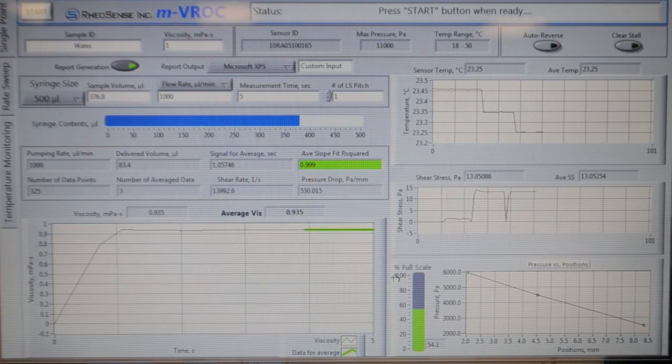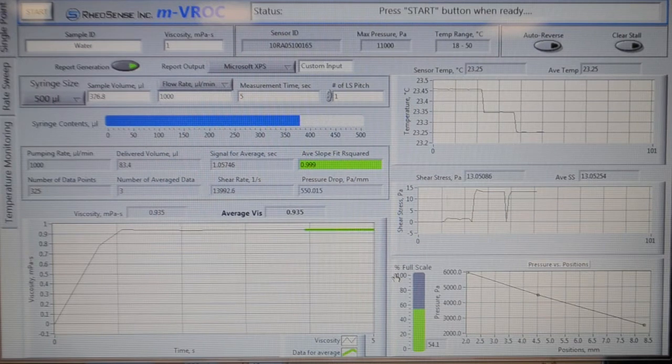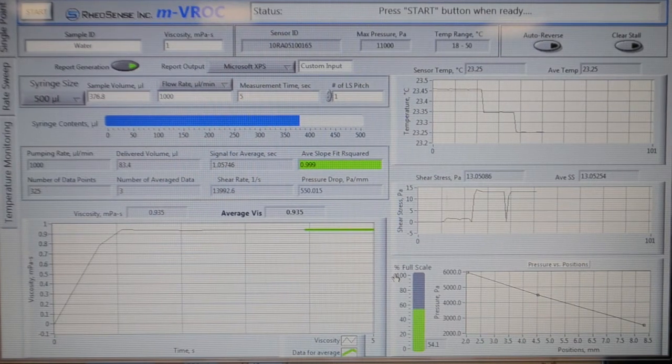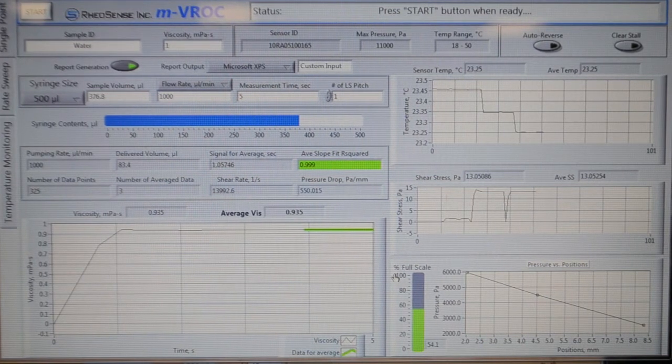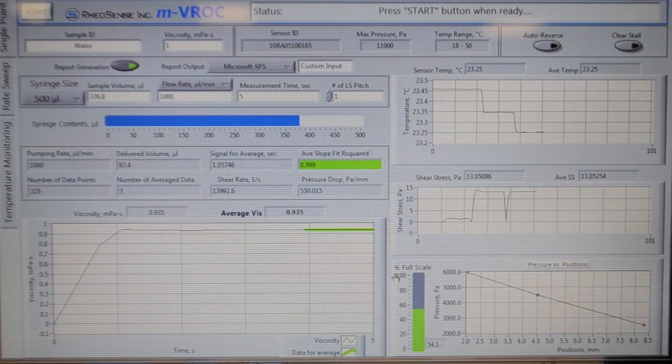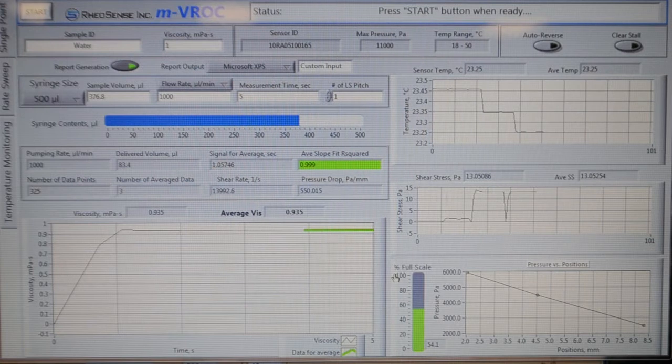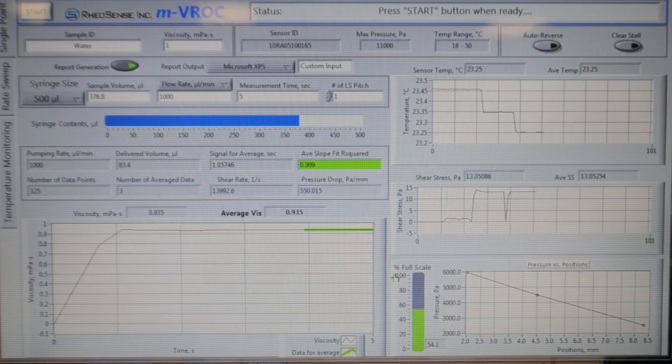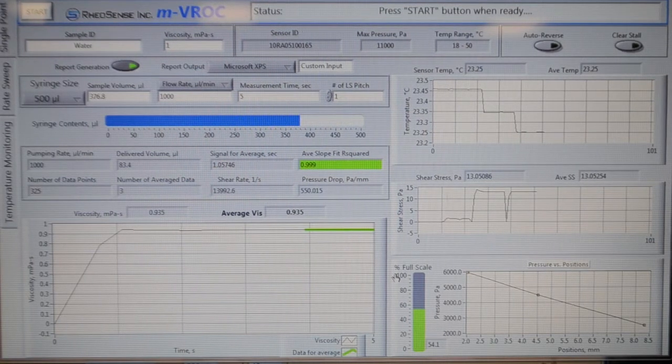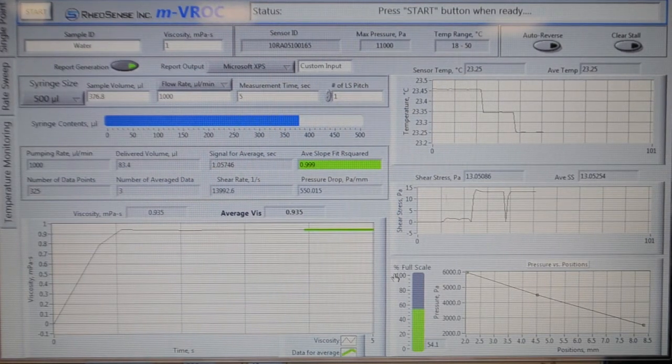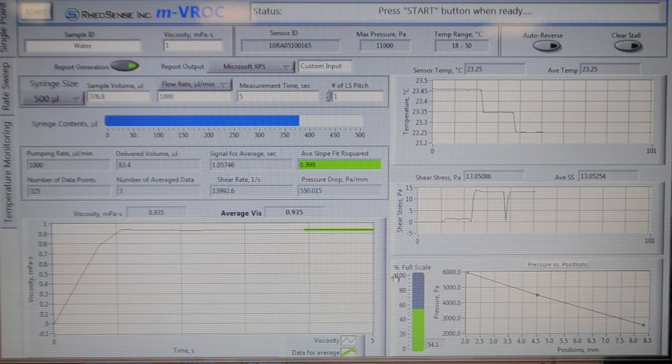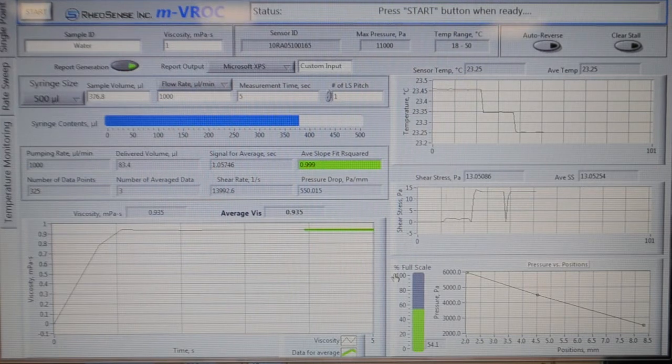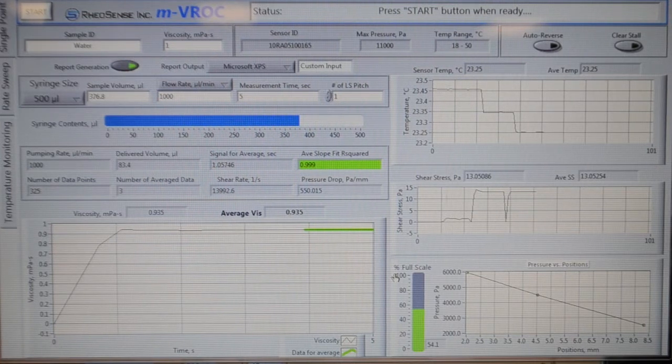This step is optional for those who want to conserve their sample. But in general, if you have plenty of sample, you should run the rate sweep measurement, since it's a much faster way of generating data points compared to single point measurement.